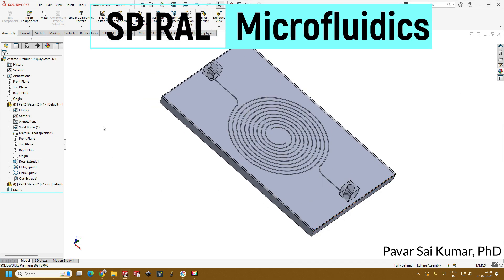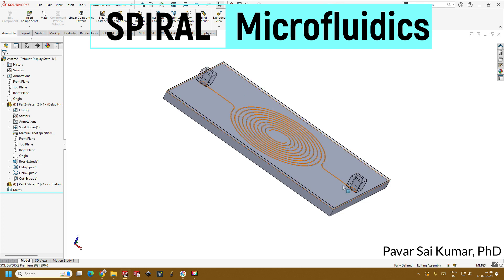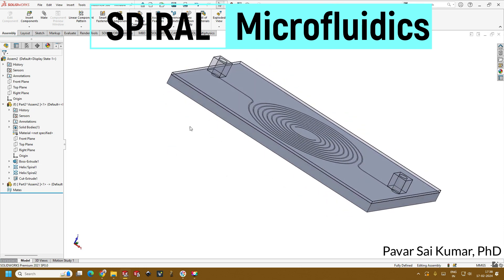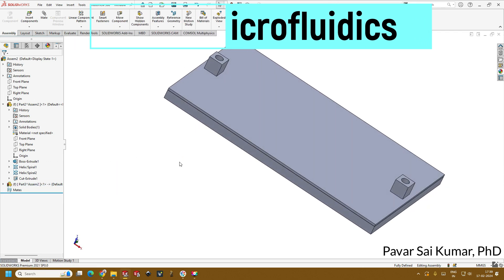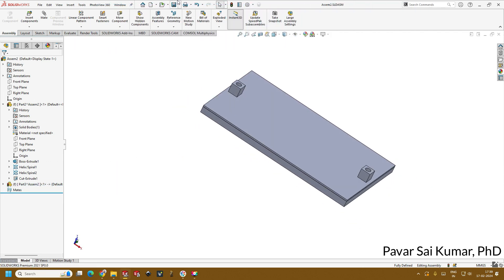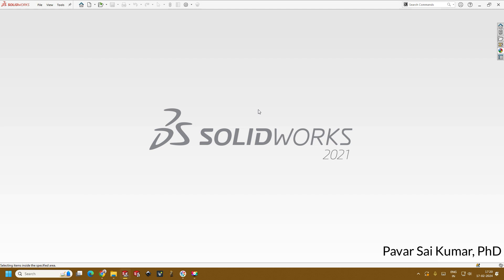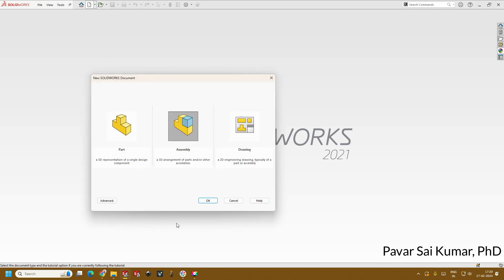Hello all, welcome to this lecture on microfluidic chip design. Today we'll be seeing the microfluidic chip design at the micron scale. We can do this as a mould making for microfluidics and we can do it as a single step process for 3D printing. So today we'll be seeing this process.